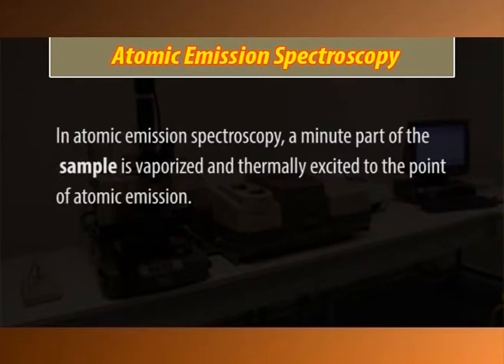In atomic emission spectroscopy, a minute part of the sample is vaporized and thermally excited to the point of atomic emission. The energy required for these processes is supplied by an electric arc or spark, or more recently by a laser or plasma composed of inert gas.